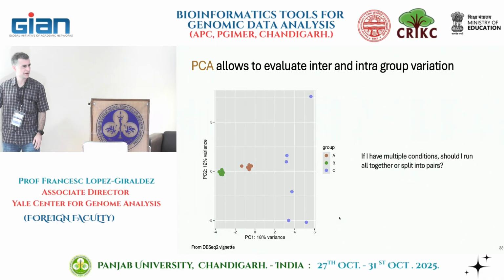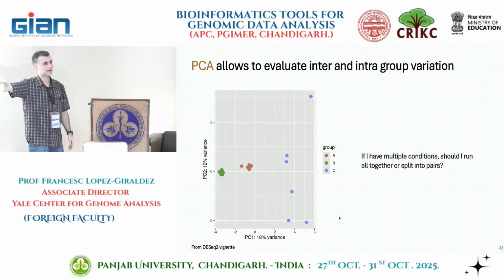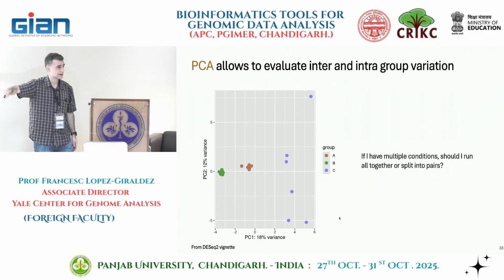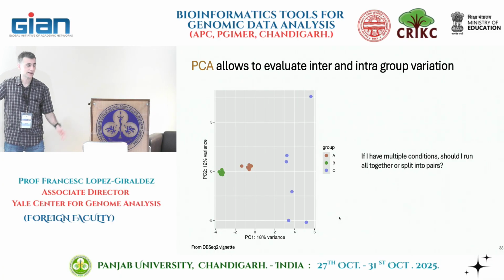So you have a question. Somebody asked me this before, maybe. So imagine these situations where all of a sudden everything clusters together really nicely, more or less, at least for PC1. You have ones that have a lot of variability. This is a bad situation in the sense that this analysis is going to be more complex. In those cases, I would recommend analyzing blue separately, if you care about this, and we can go into details. If somebody has questions about this, I'll answer them.